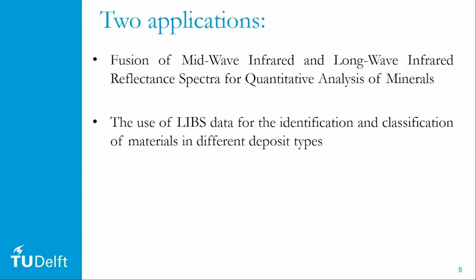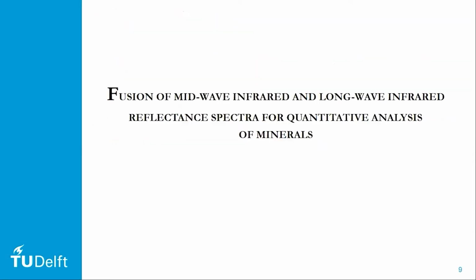In this presentation, I will show you two particular examples. The first one is the fusion of mid-wave and long-wave infrared data for quantitative analysis of minerals. The second one is the use of LIBS data for the identification and classification of materials in different deposit types. The second one is work in progress. I will come to it later. First, let's see the results from the first application example.